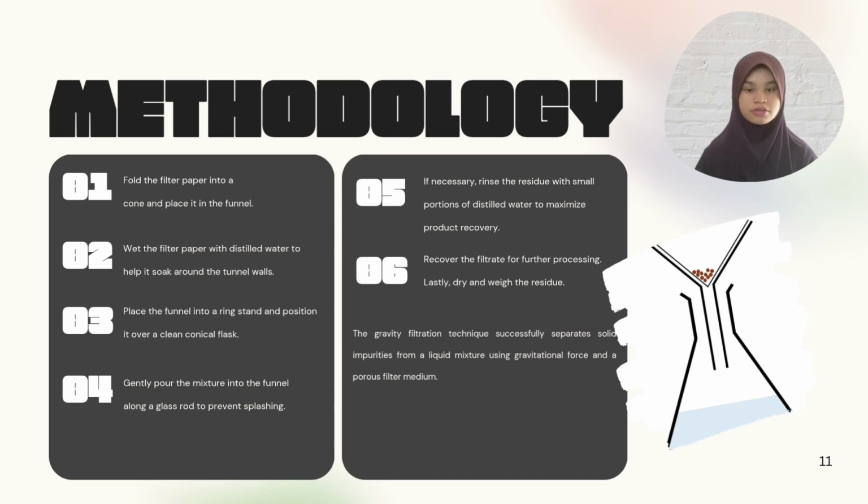As a conclusion, the gravity filtration technique successfully separates solid impurities from a liquid mixture using gravitational force. This method is straightforward and cost-effective, and it is widely applicable in both laboratory and industrial purposes.